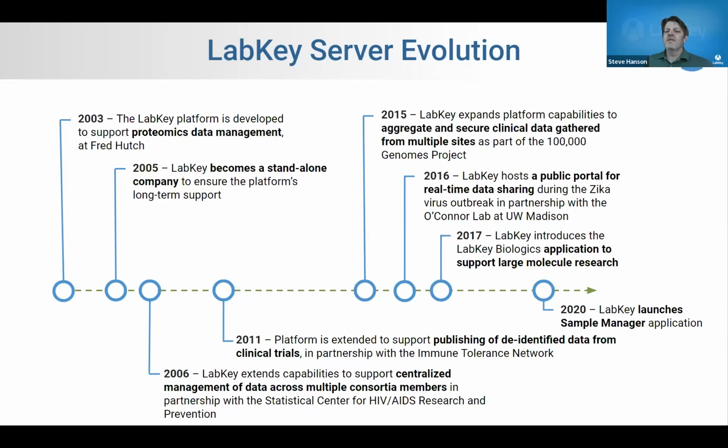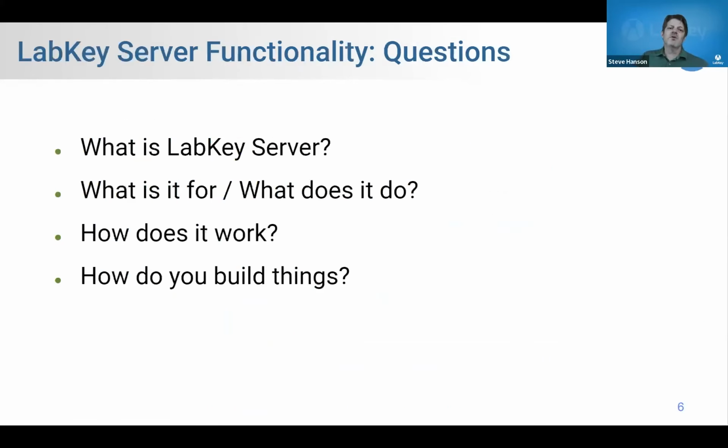But there's really something in the toolkit for all of them. So I've already answered my first question here. What is LabKey Server? It's an enormous toolkit with all kinds of apps and dashboards and mini tools that you can assemble together to build your own solutions to your own scientific problems.